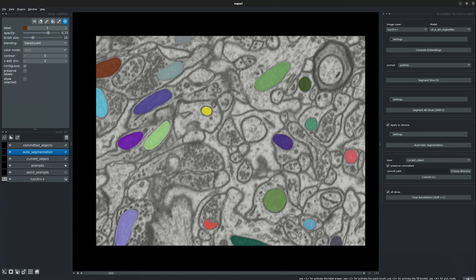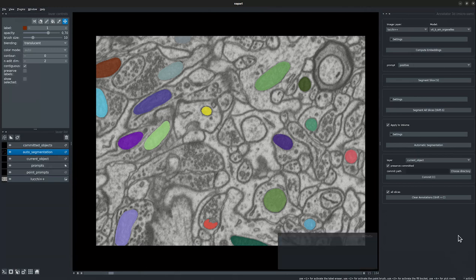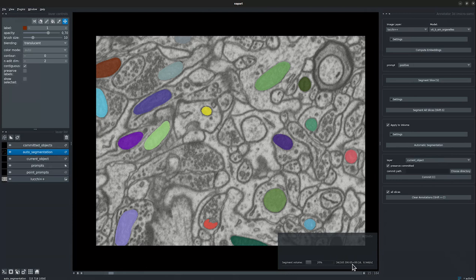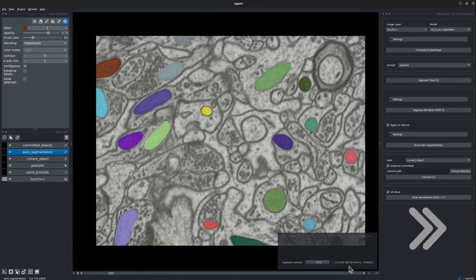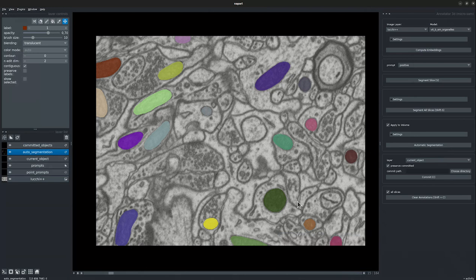Otherwise it would take a few minutes on a CPU resource. Now let's go ahead and press automatic segmentation for the entire volume. Here is the progress bar which keeps you updated about the segmentation status. The entire volume has been segmented.